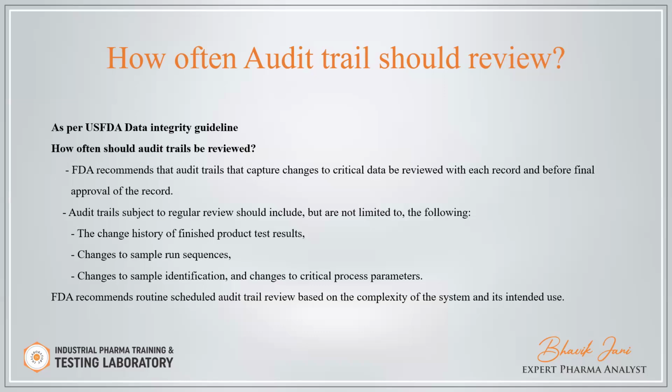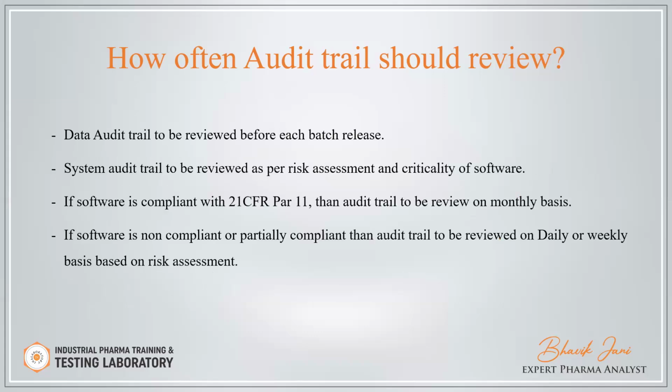FDA recommends a routine schedule for audit trail review based on the complexity of the system and its intended use. FDA said that based on the complexity of your software, you have to periodically review your audit trail. Likewise, the data audit trail is to be reviewed before each batch release. The system audit trail is to be reviewed as per the risk assessment and criticality of the software. You have to prepare a risk assessment, and based on it, you can define your frequency.